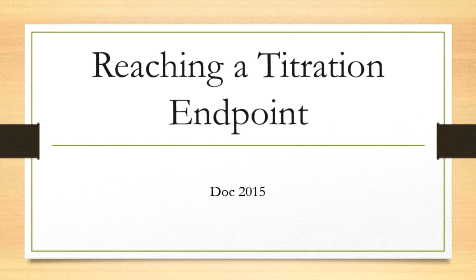Today we will look at titration. With titration endpoints, the critical part is getting that green color.